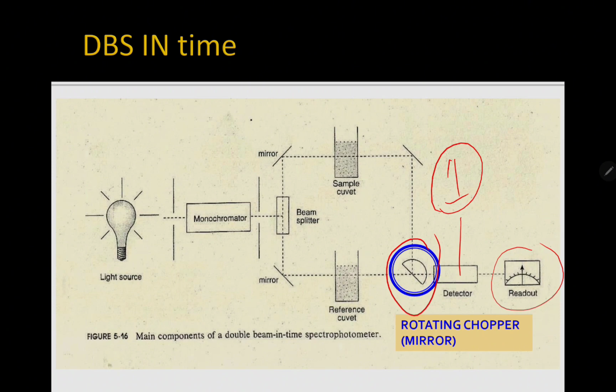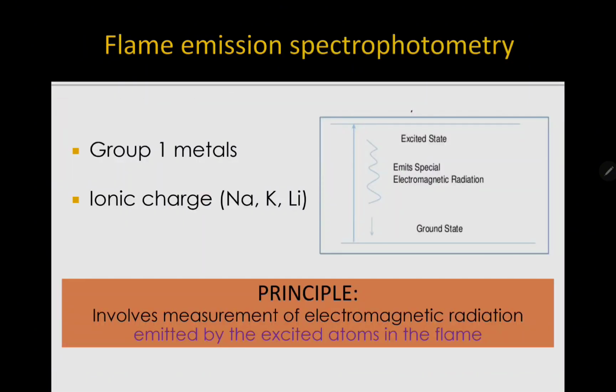So basically guys, a double beam spectrophotometry may be much more expensive. However, it can be better because meron tayong reference cuvette. Okay, so depende maganda siya sa specimen na inyong ginatest. So that is for the double beam spectrophotometry. Okay, so let's move to the flame emission spectrophotometry.